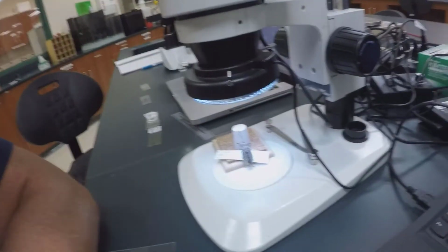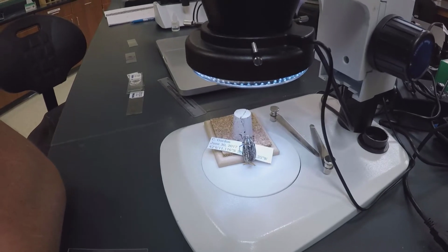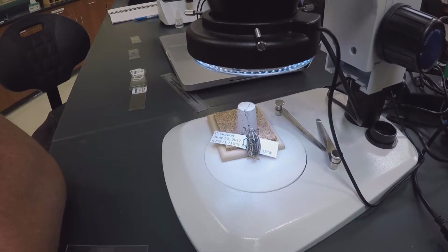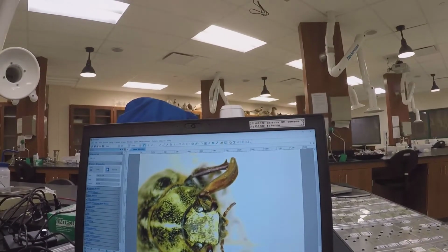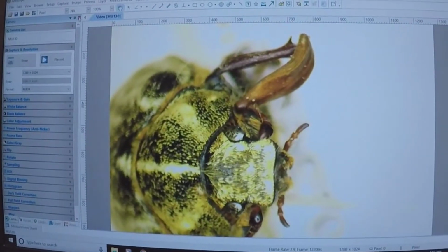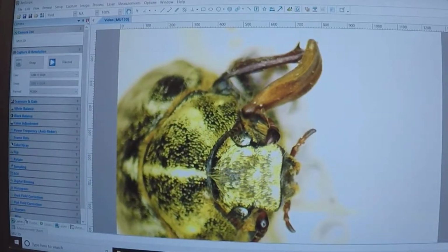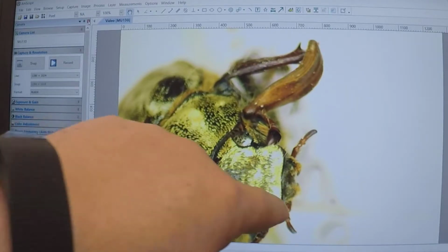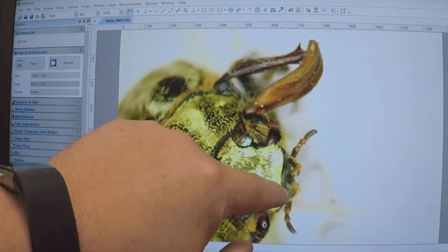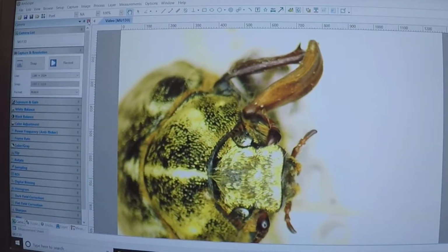Here I have what's sometimes called a June bug or a June beetle, and they have a unique kind of head to them, and underneath the scope, that's what I have pictured here. You can see the eyes, and then you can see these scoops, and those scoops are their antennae. So they have very unique antennae. You can see the pedipalps, these feelers, and then you can see the mandibles, which are the pincers or the biting mouth parts of this insect. That's at 7 times your eyesight.